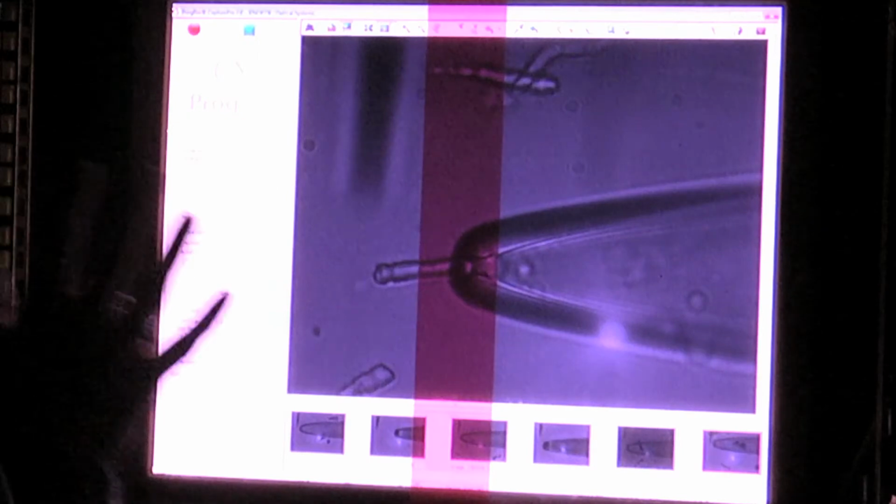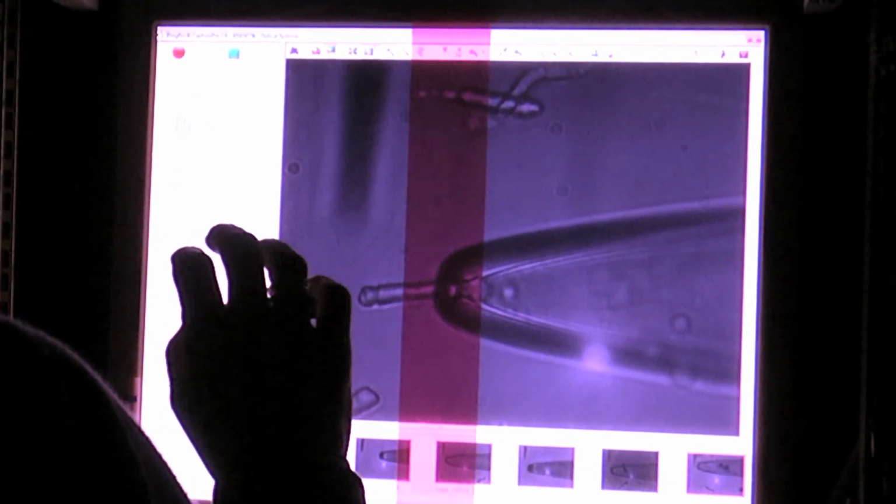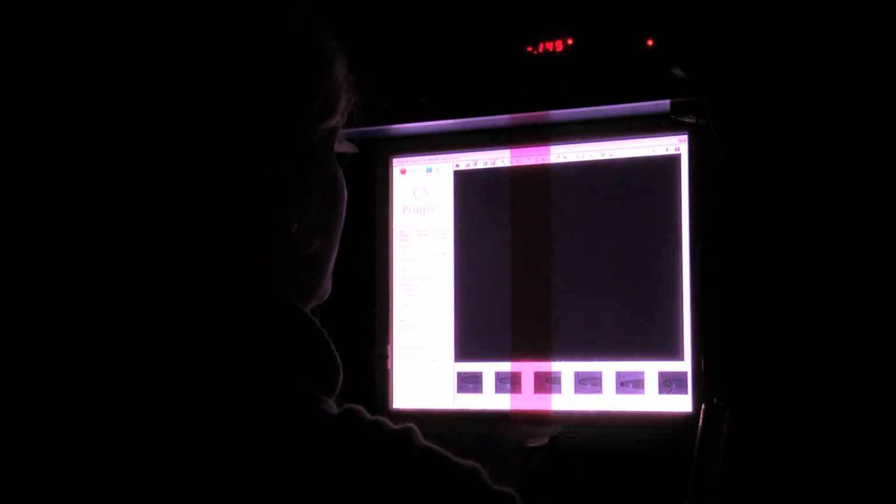My name is Monica Mazzolini and I work in the Professor Torre group. Working with the retina and in particular with the rods, I needed a completely dark condition, only with a small red light. And I use two different kinds of technique. So I combine the old electrophysiology, named suction electrode technique, with new devices used to stimulate the cell.